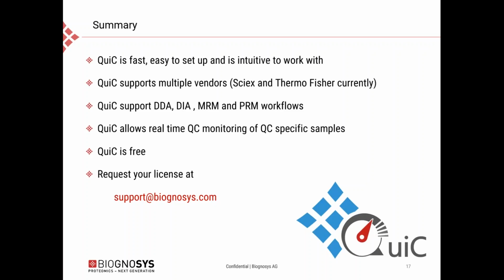So the first question was, are older mass spectrometers also supported, like the Thermo Orbitrap XL? Yes, QuiC analyzes all mass spectrometers from Thermo and Sciex without any restrictions on age. So the entire platform is supported.